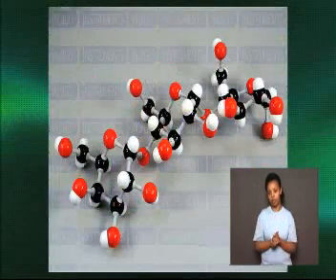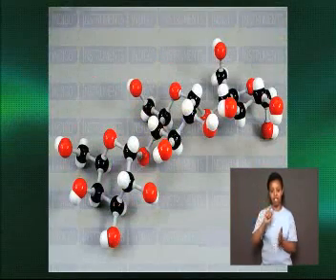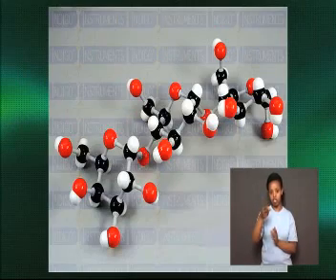Although, after this treatment, it is no longer considered sucrose. The acidic conditions and heat break the glycosidic bond in sucrose through hydrolysis. The products of the decomposition of sucrose are glucose and fructose, both of which can be detected by Benedict's reagent, as described above. Polysaccharides, like starch, react negatively to Benedict's test.